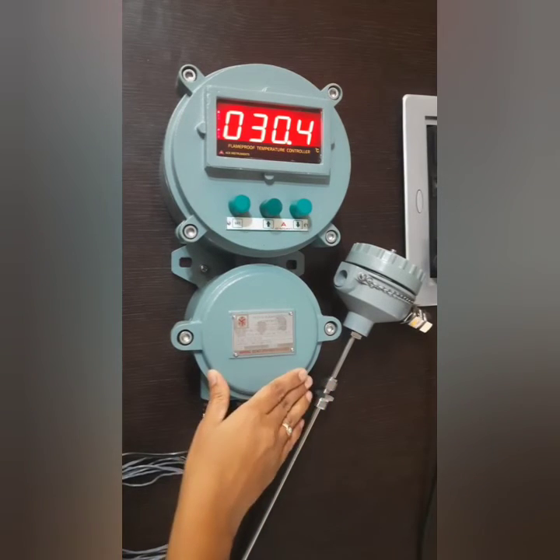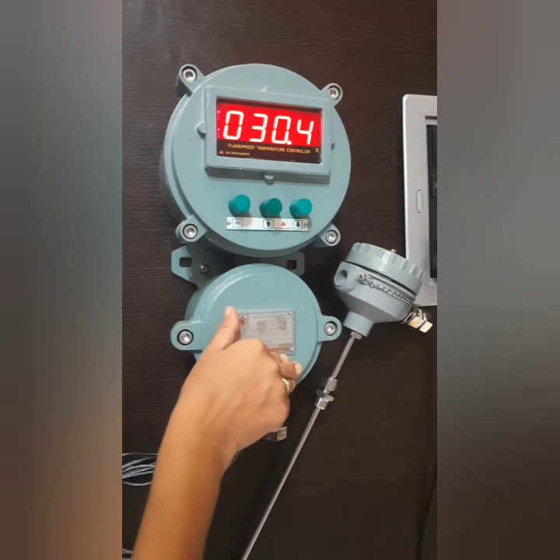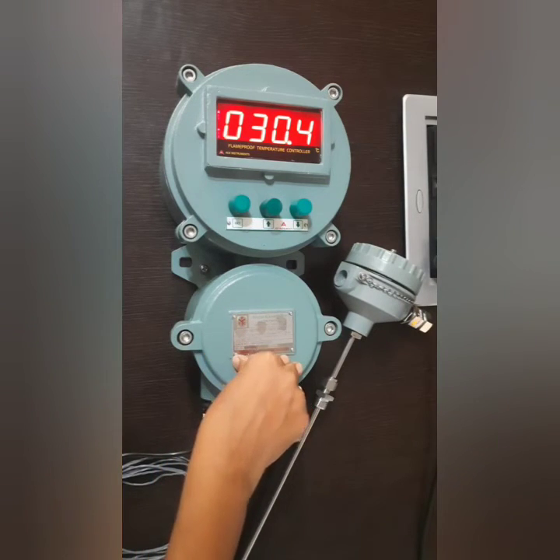This instrument is also certified by CIMFR Dhanbad for gas groups 1, 2, 2A, and 2B.